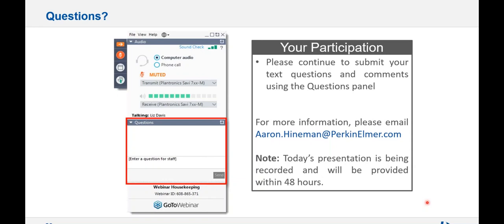Aaron, have you? I usually leave it at default as well. I think BOC is about 2 seconds or something like that, so I usually don't modify it either. If anything, if it's a read delay because you're using some sort of flow system, then that's what you modify, not the BOC usually.